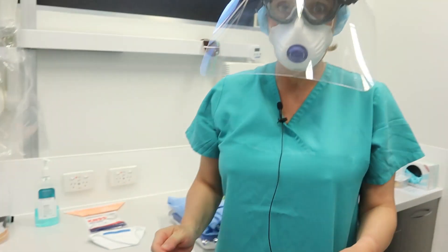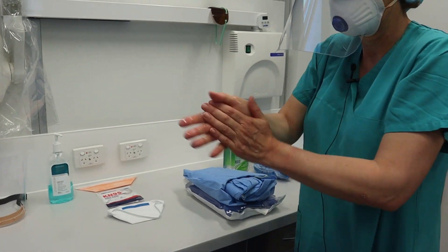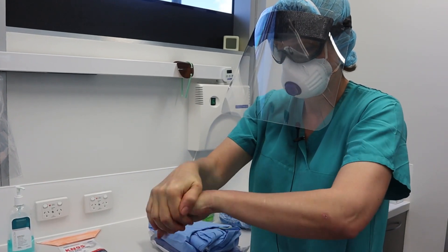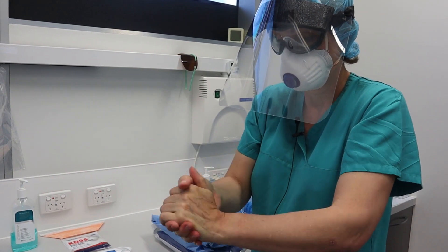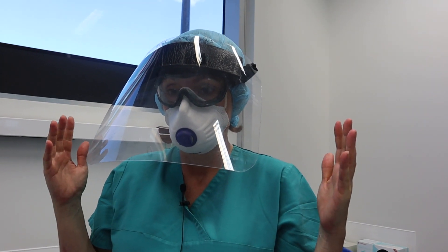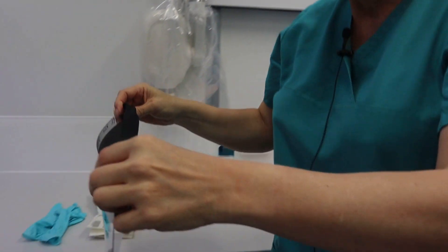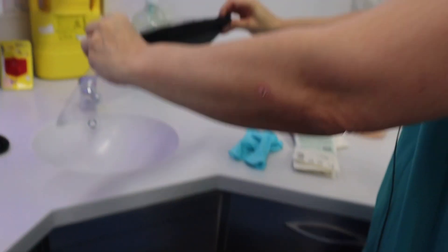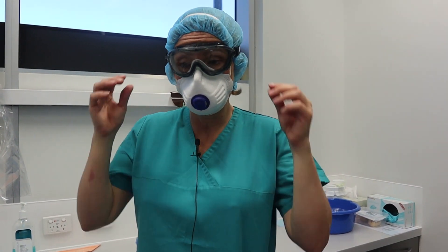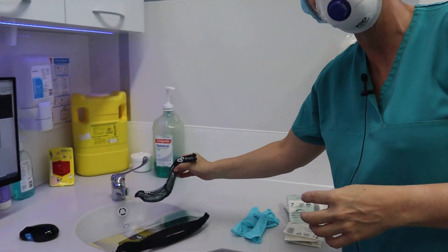Now my hands are definitely dirty so a bit more hand washing. Doffing the top is the most critical part because we want to protect the airway and eyes. First I remove the visor — if it's disposable it goes in the bin; if it's non-disposable it goes in the sink to be disinfected. The next thing I'll take off is my eye protection, the goggles — again, these go into the sink to be disinfected.